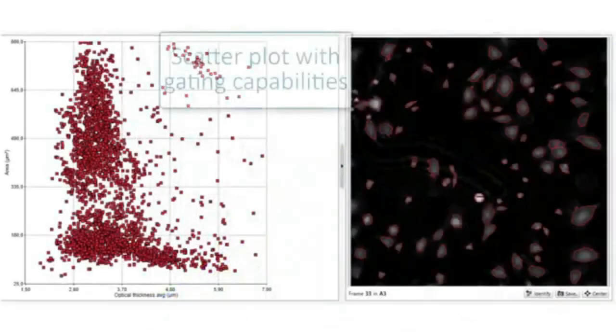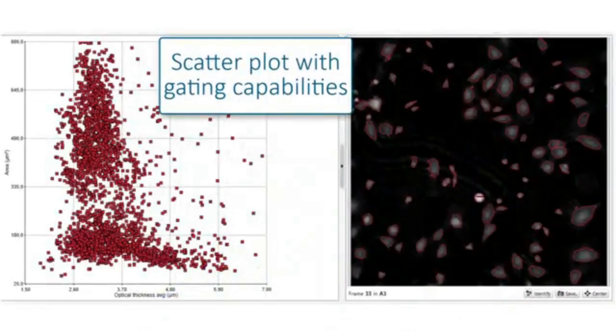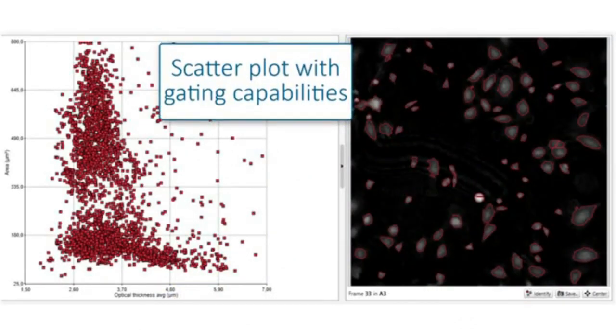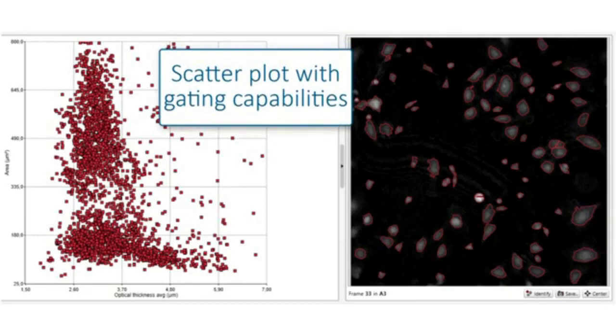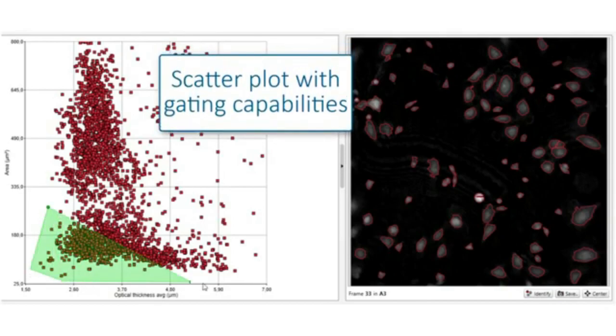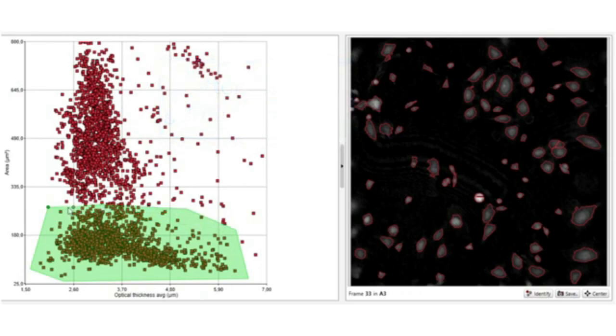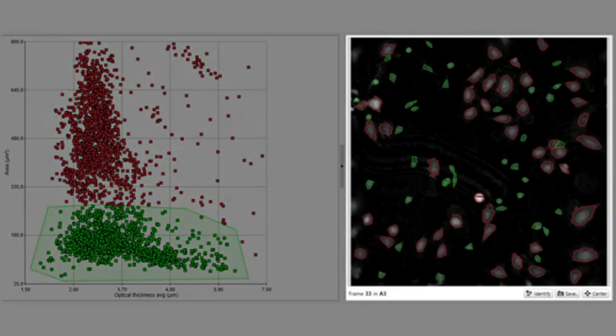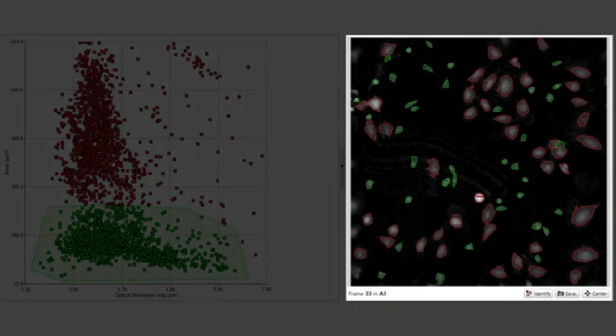The software also generates a scatter plot resembling flow cytometry analysis. Two parameters are plotted against each other, and the gate can be applied to group cells based on their properties. Here, the green gate defines the subpopulation of smaller cells. For easy identification, the gate color is applied in the images as well.